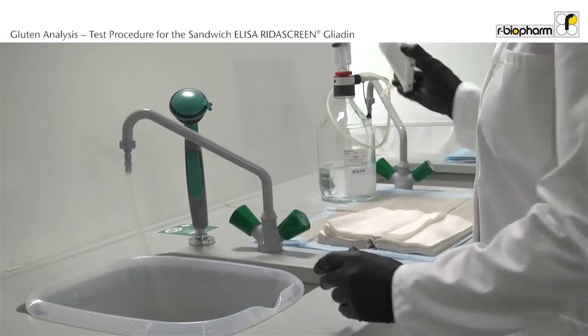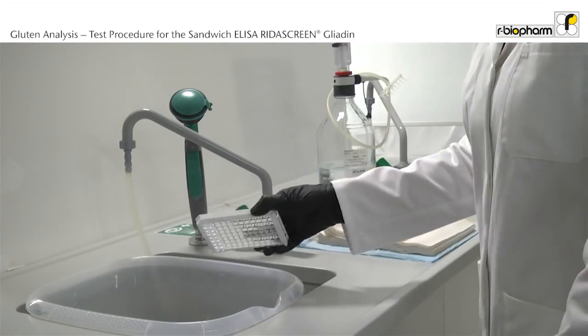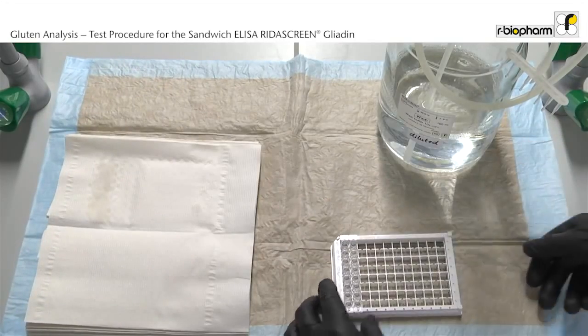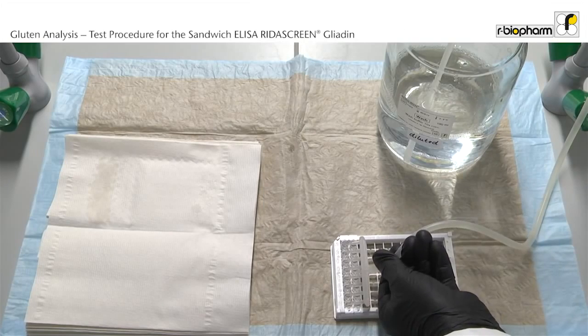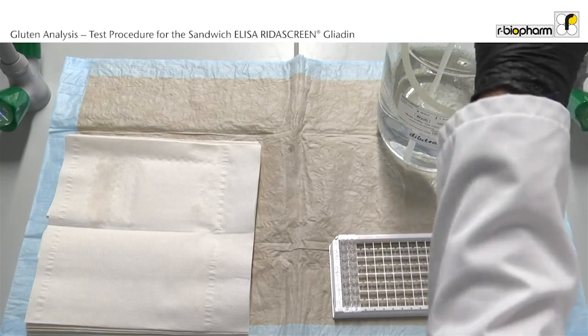Discard the liquid from the wells using an angular and forceful motion to properly remove all liquid content. Vigorously tap the inverted plate on a dry and absorbing surface to ensure that all liquid content has been removed from the wells. Fill the wells evenly across the plate with 250 microliter wash buffer.